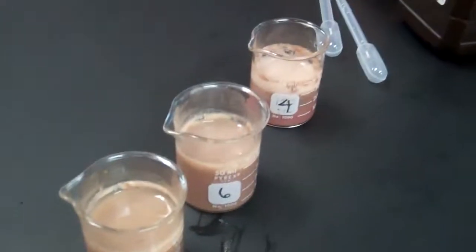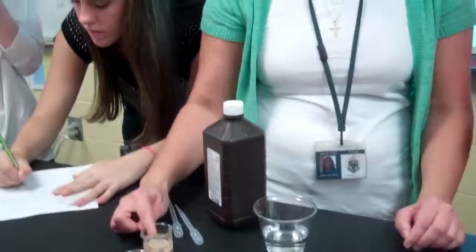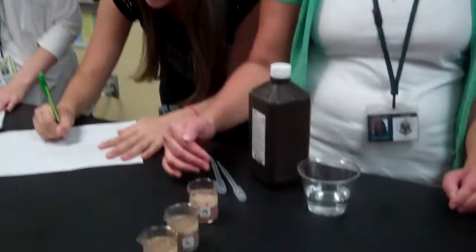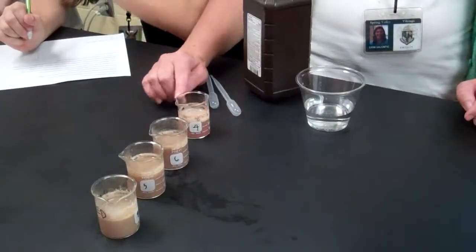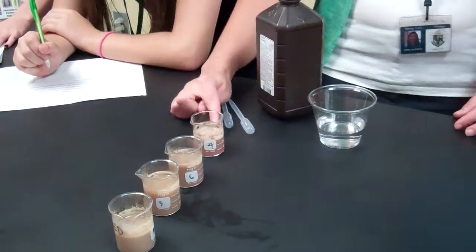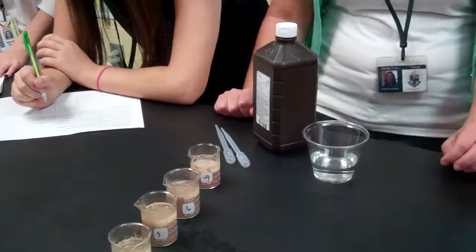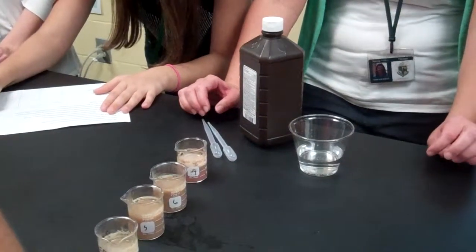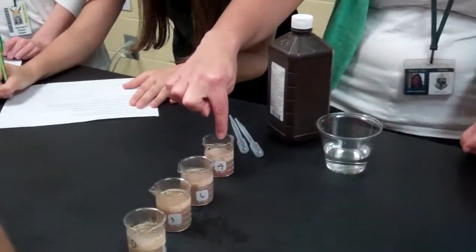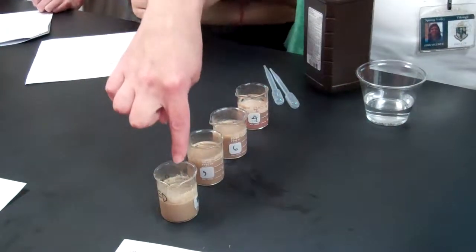They're different shades of orange brown. Yeah, this one, I don't know if you guys saw it when I brought it out of the refrigerator, but it had separated, and this was really red at the bottom, kind of bloody looking, but I mixed it all up. So it's a little bit more pink than the others. Which one's which? Raw, base, acid, boiled.